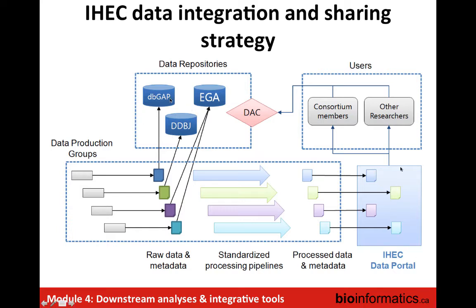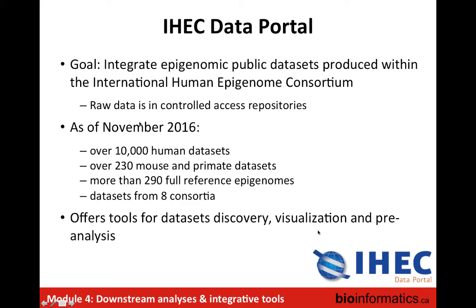The site where you can download this data is the IHEC data portal. You can navigate, and we'll cover that later in the workshop, but it's the place where you can search for your data sets of interest and download the peaks or the methylation sites and methylation levels for different sites on the genome and so on. And yeah, that pretty much covers it.